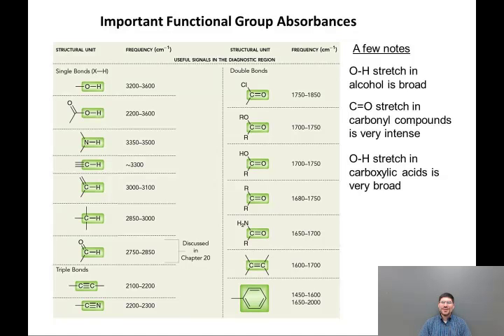In this lesson, we will examine exactly where to find the functional group stretches for different functional groups in an IR spectrum. So I will be going back and forth between the chart on this slide and examples of spectra of different functional groups on the next 4 slides. So it will be a little choppier than normal, but this is really the only way I can show you what I want to show you.